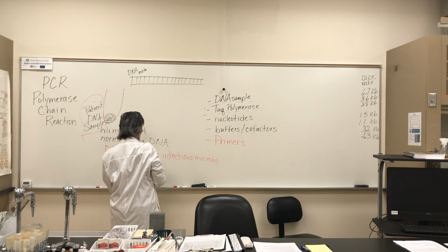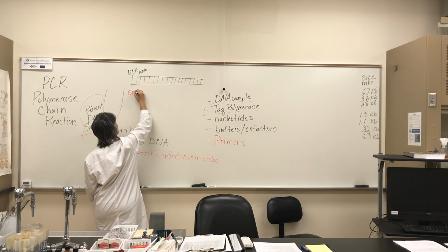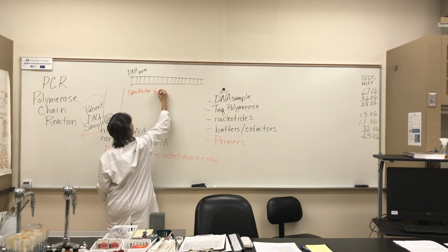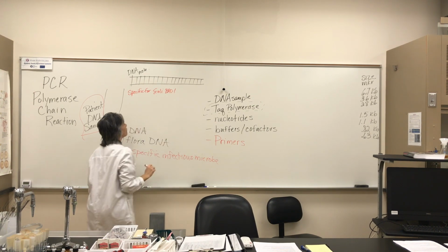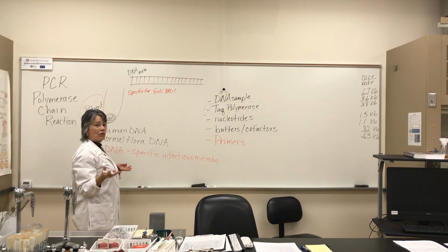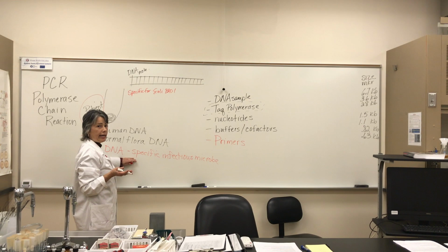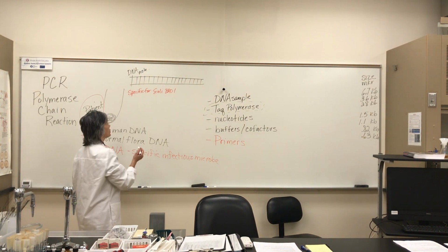And what it's representing is DNA specific for this E. coli bad 1 strain. So here's the research that has to happen before a DNA test. We've got to find DNA that's specific to that strain of that microbe, and we've got to get primers.